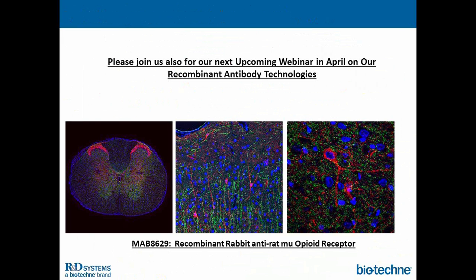The other thing that we don't have a lot of experience on is the background on IR dyes on membranes, but I'm assuming that that's all corrected for. So the only point of concern would be the sensitivity levels. They will change going from a chemiluminescent system to an IR.